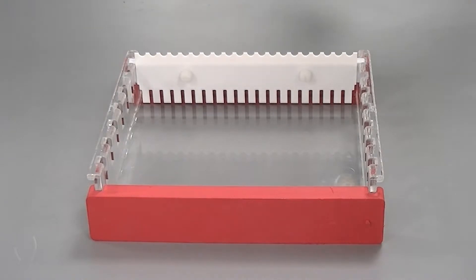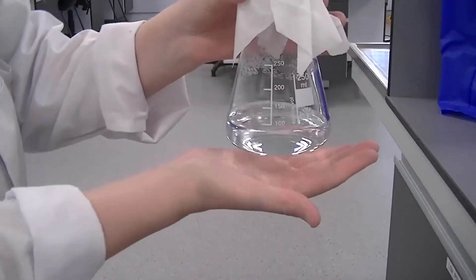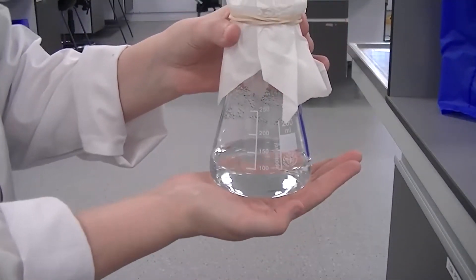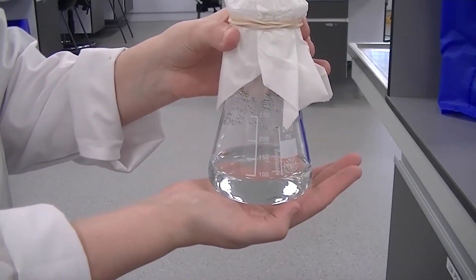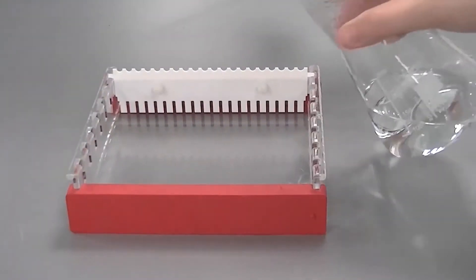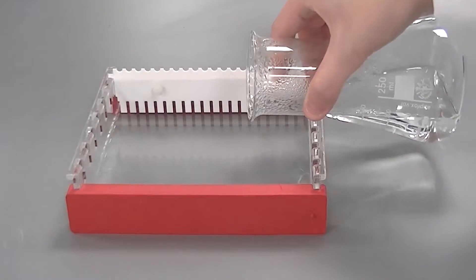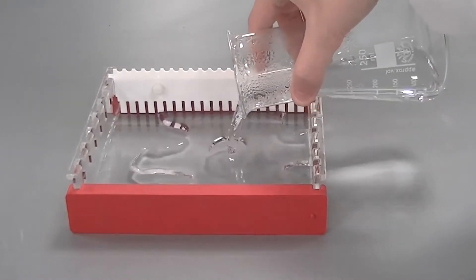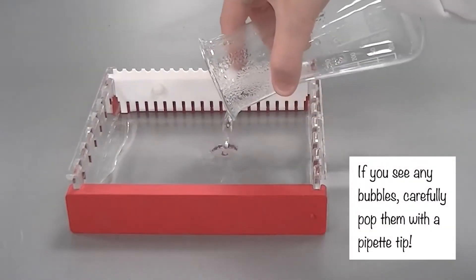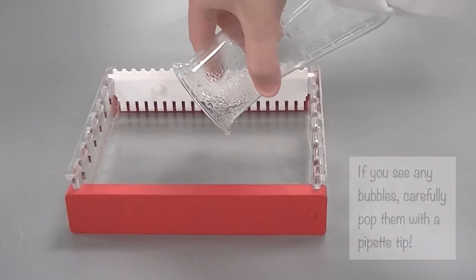The gel is ready to be poured when you can comfortably hold the bottom of the flask. Slowly pour the liquid into the casting tray, taking care not to introduce any bubbles. Then wait until the gel has solidified.